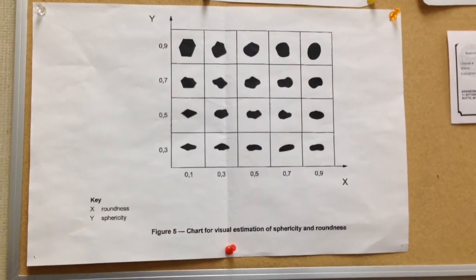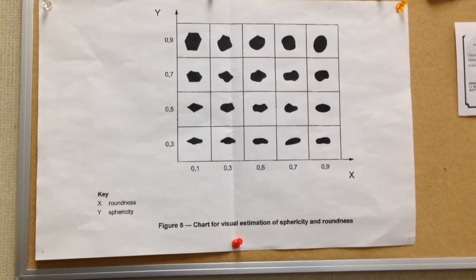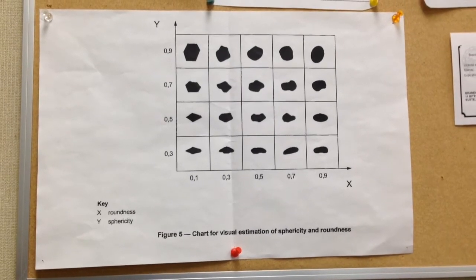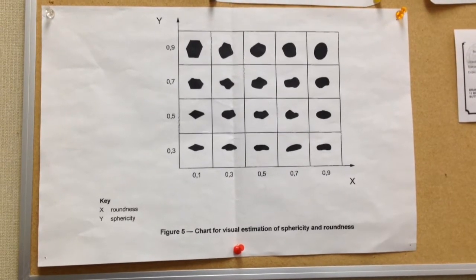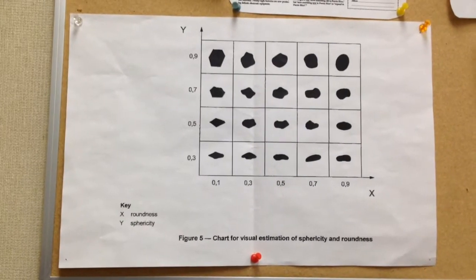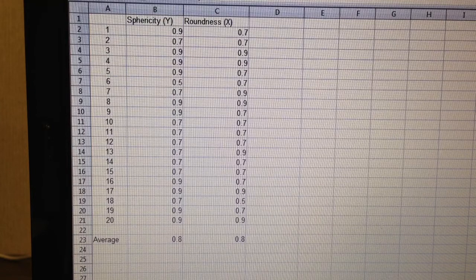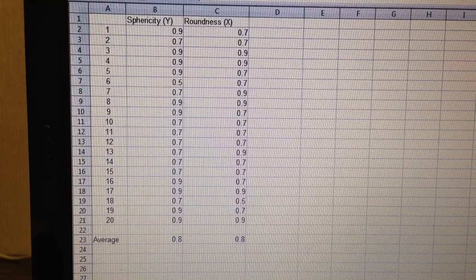After that, we go ahead and compare every single particle to this chart up here, which has the 0 to 0.9 values for sphericity and roundness, with sphericity being on the y-axis and roundness being on the x. This is a purely visual interpretation, so it takes a lot of practice to actually become consistent and true with your values. These values are then placed into a spreadsheet with sphericity in the y-column and roundness in the x. The values are averaged together and both sphericity and roundness must score at least a 0.6 to be considered frac sand.